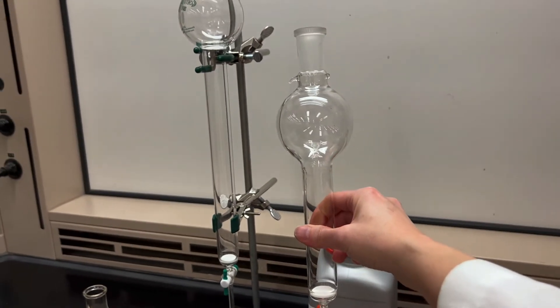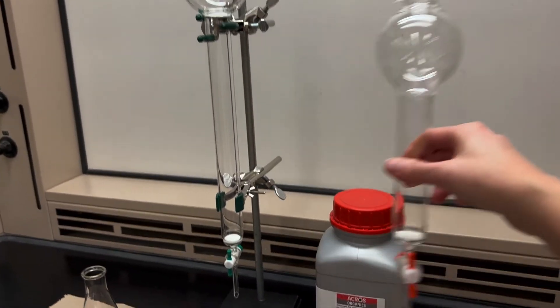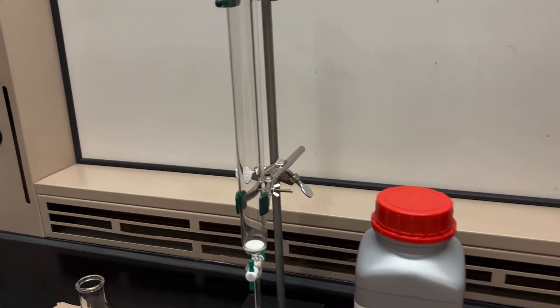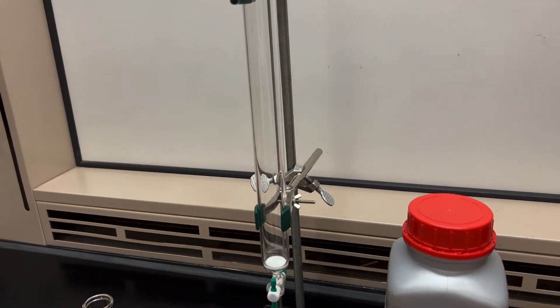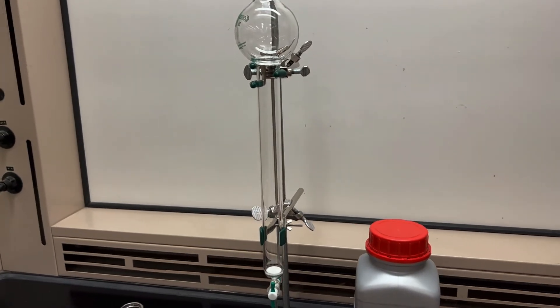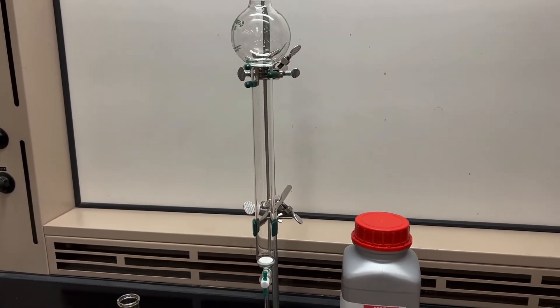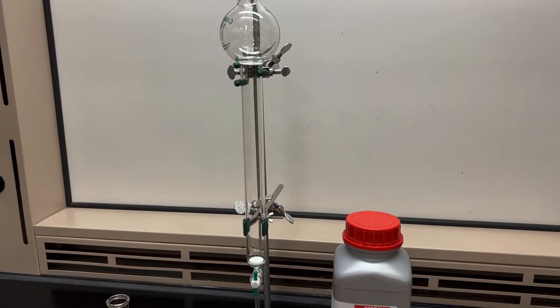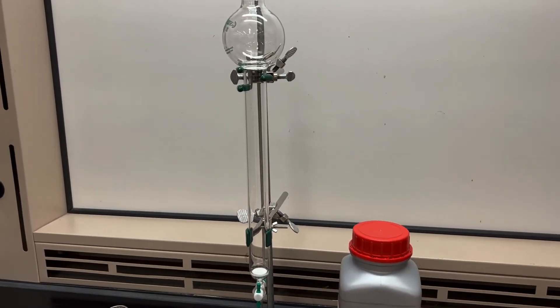There are lots of different kinds of columns. They can be different heights, different widths. You might have to put a piece of cotton in the bottom of the column. The ones that I have actually have a glass frit so we don't need to do that. But whichever one you have, the first thing to do is to clamp your column to a ring stand and bring that to the fume hood.